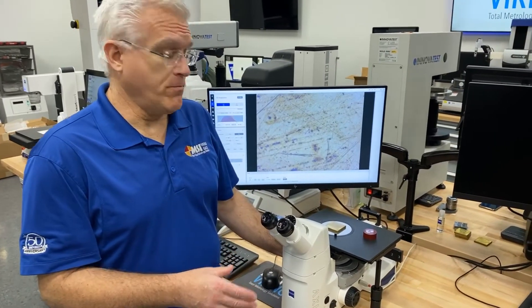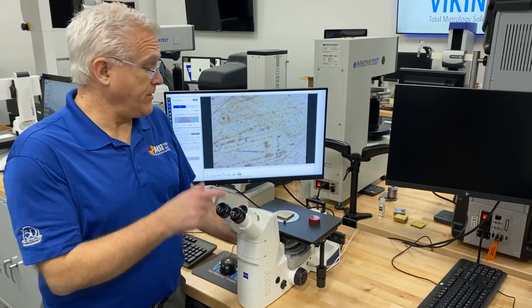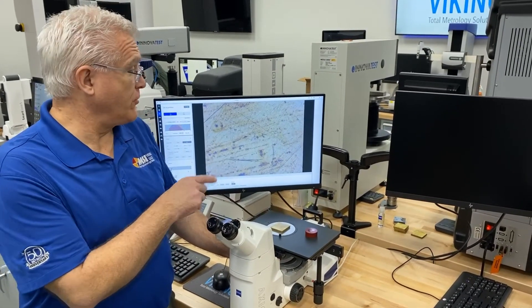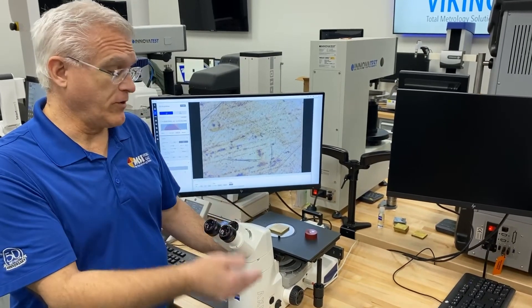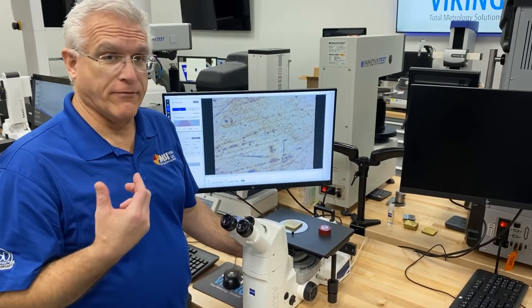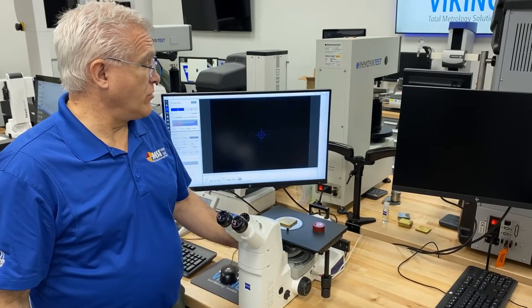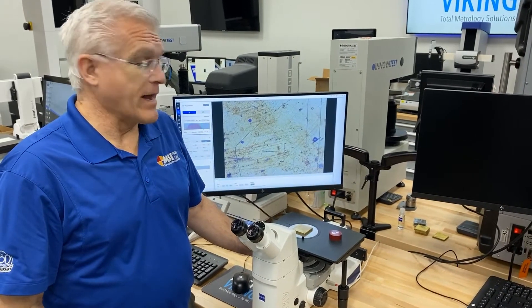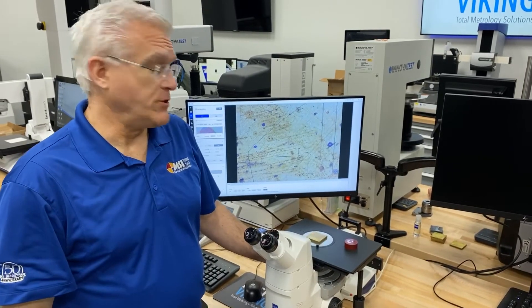It's a manual microscope, compact in footprint, but it's very efficient. It's fully encoded, which allows your software to know what magnification level you're using or what type of light path you selected. It also lets you have other advantages, such as lighting control — when you change your objective, it'll automatically readjust for the different lighting requirements of that objective.